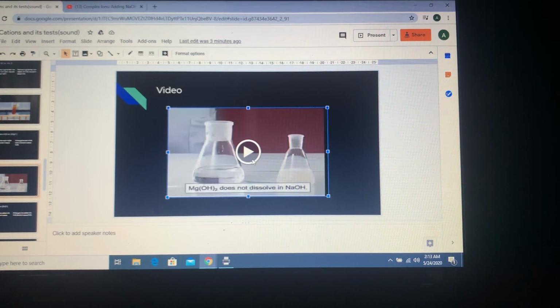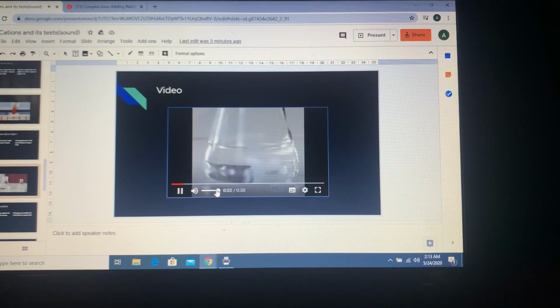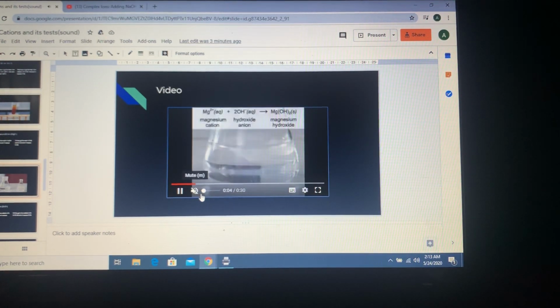So this is the video showing the person adding NaOH to the solution containing magnesium cations. The person added NaOH to the solution containing Mg2+.